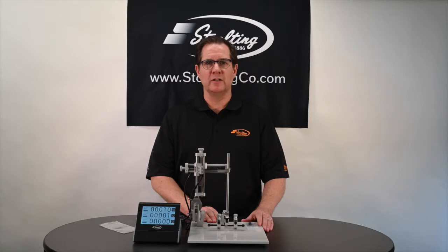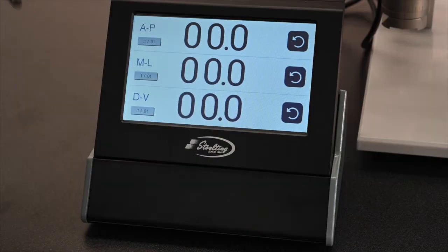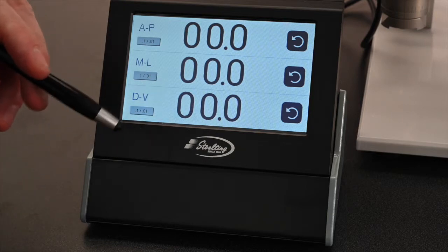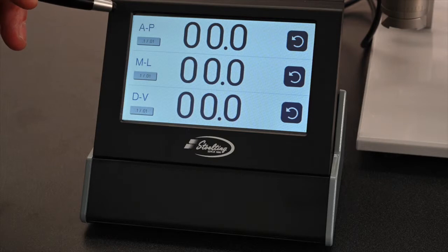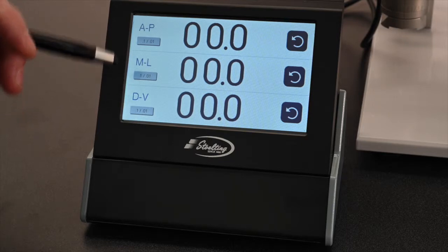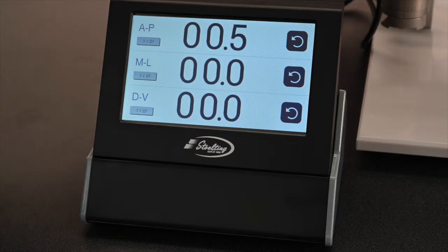Now I want to tell you some of the advantages associated with the 51730D Digital Stereotaxic just for mouse, and I want to show you the display. Using the digital display is very easy — it's all a touchscreen display. You can use your finger if you want. You see the identifications for each of the axes: AP stands for anterior-posterior, ML is medial-lateral, and DV is dorsal-ventral. These same three labels are on the back of the instrument for making your connections. To move the numbers, simply turn the dial — as I turn the AP drive, you can see the numbers changing, instead of having to read the vernier scale. The same applies to ML and DV.